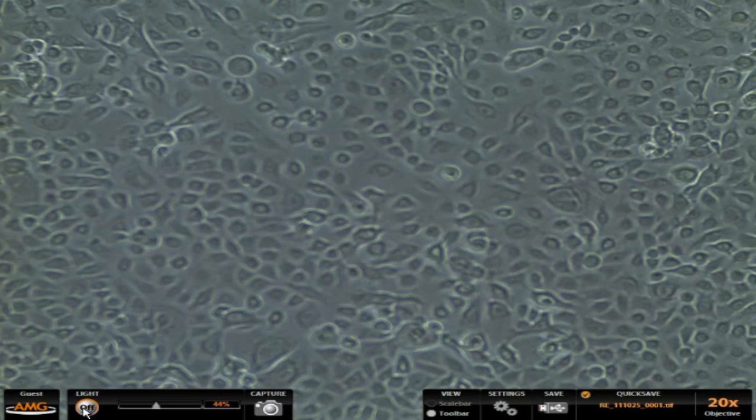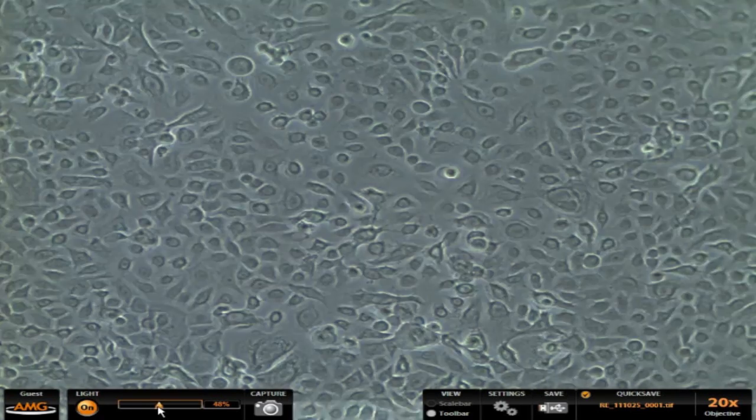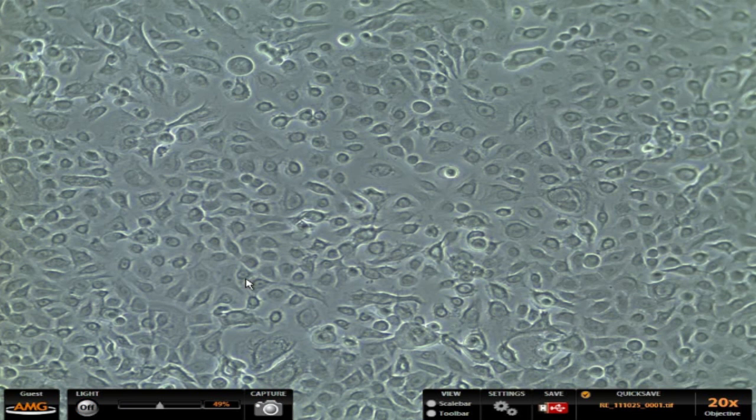Okay, to start, I'm just going to take my mouse and go down to this light button, turn on the light, focus, and maybe increase the brightness here by using this slider. That looks good. When I find a nice field of cells, I can click capture. And now that I've captured the image, I can do my cell counting.